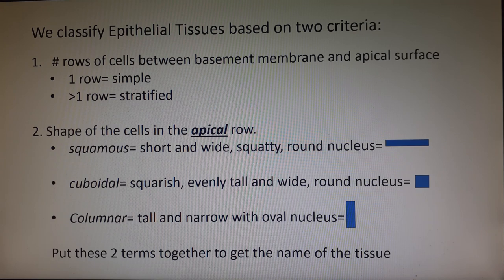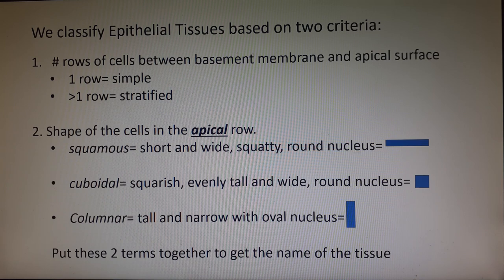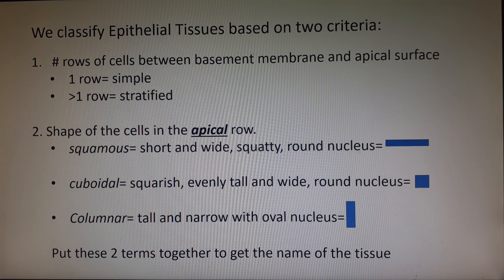The second criterion, which gives the tissue its second part of its name, is the shape of the cells in the apical row. It does not matter what shape the cells are if they're not in the top row — only the top row matters. If there is only one row of cells, obviously that is the important row. We're going to look at the apical row, and there are three possible shapes: short and flat, kind of square, and tall and skinny.